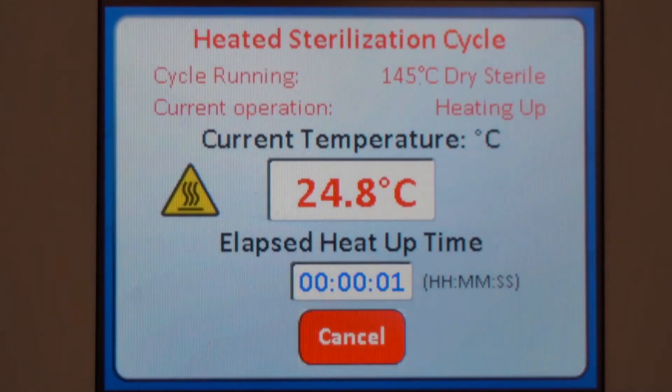The incubator screen will display each phase of the decontamination cycle as it occurs. A moderate heat smell can be expected when the cycle is running.